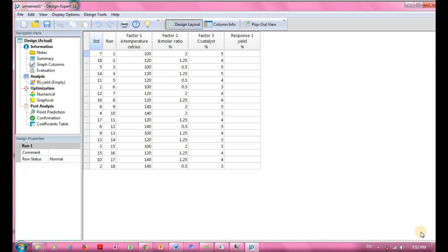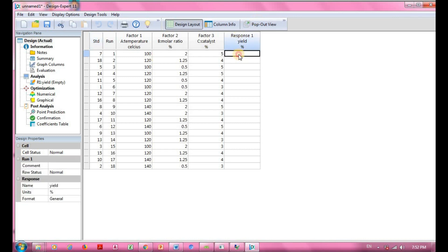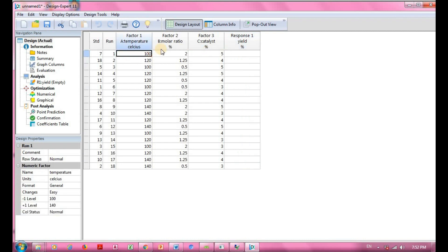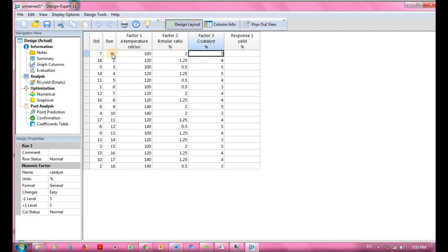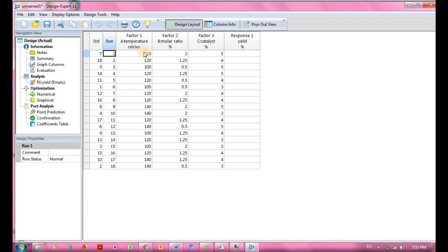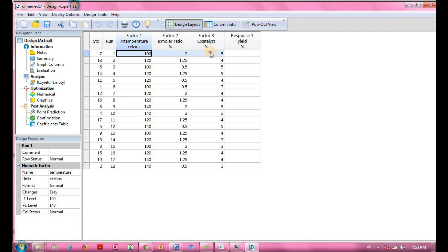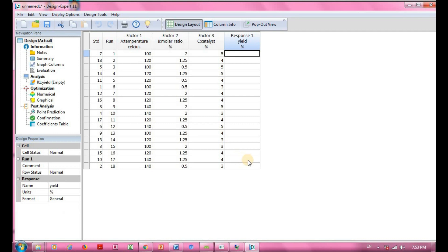Click Finish and this is the layout of your total experiment — 18 experiments in total. For the response 'yield', you must conduct each experiment and key in all the data manually using the parameters set by Design Expert. For example, run number one specifies temperature at 100°C, molar ratio at 2, and catalyst at 5%. Once you have your response values, fill in all the data.